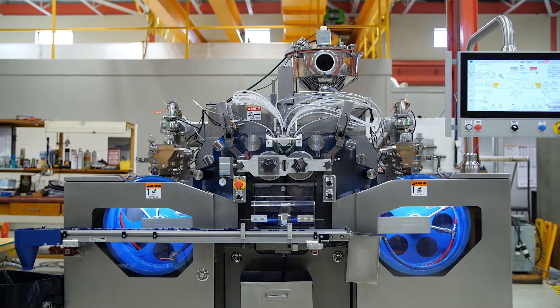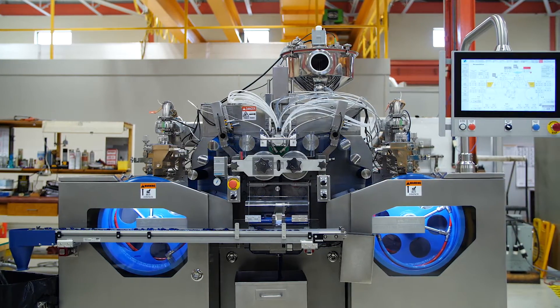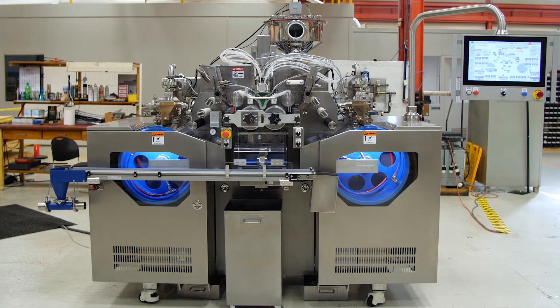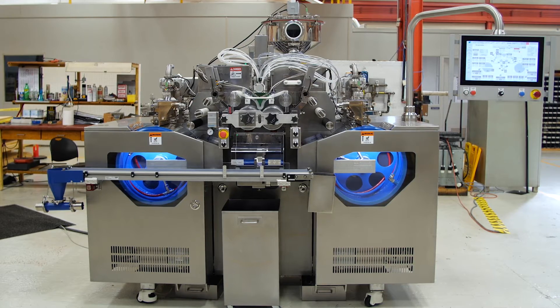Due to the upgrades in technology, we were able to make the footprint of the machine smaller than its predecessor, the SGM 612i.